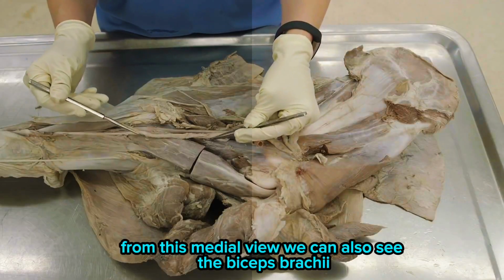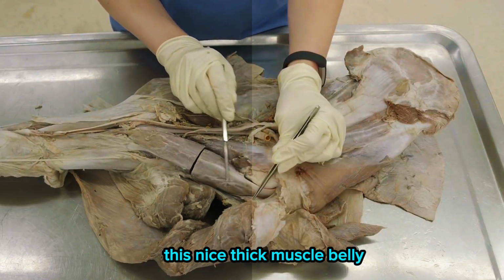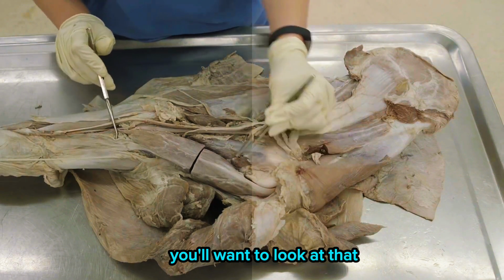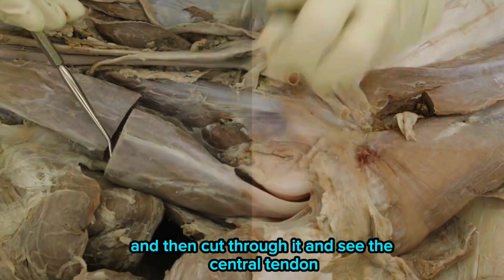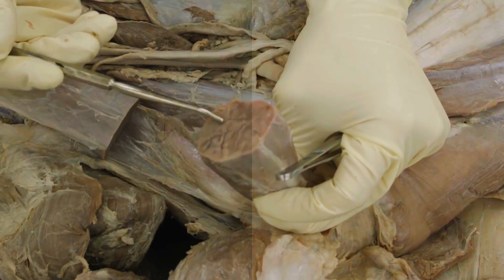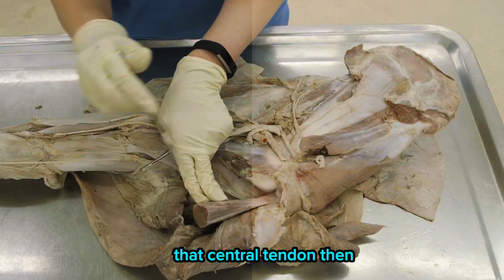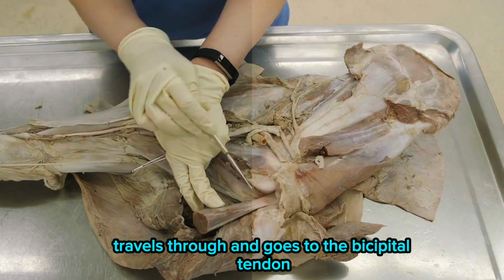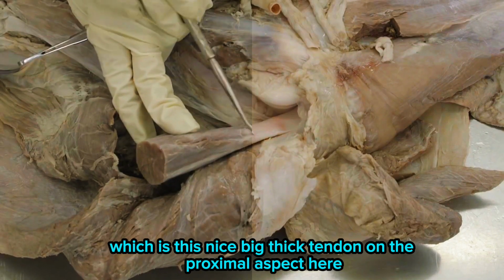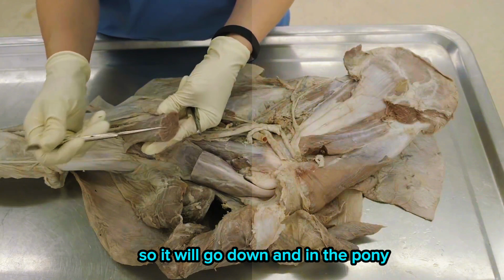From this medial view, we can also see the biceps brachii, which is the muscle that's been cut here, this nice thick muscle belly. So this is biceps brachii. You'll want to look at that and then cut through it and see the central tendon. So the central tendon kind of running in the middle there. And you want to note that that central tendon then travels through and goes to the bicipital tendon, which is this nice big thick tendon on the proximal aspect here. And then it also travels distally, so it will go down.